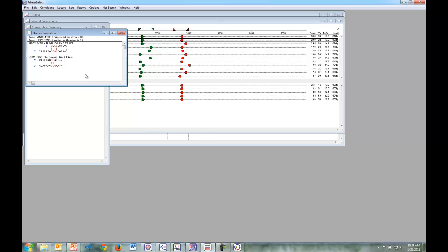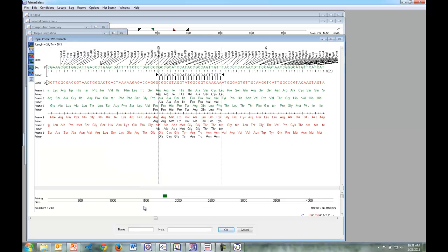As in SeqBuilder, we can also choose to edit our primers. We can select Edit, work on Upper Primer, and this opens up this nice primer editing dialog here. Again, we can choose to adjust the length of the primer or quickly introduce primer mutations and work from there.